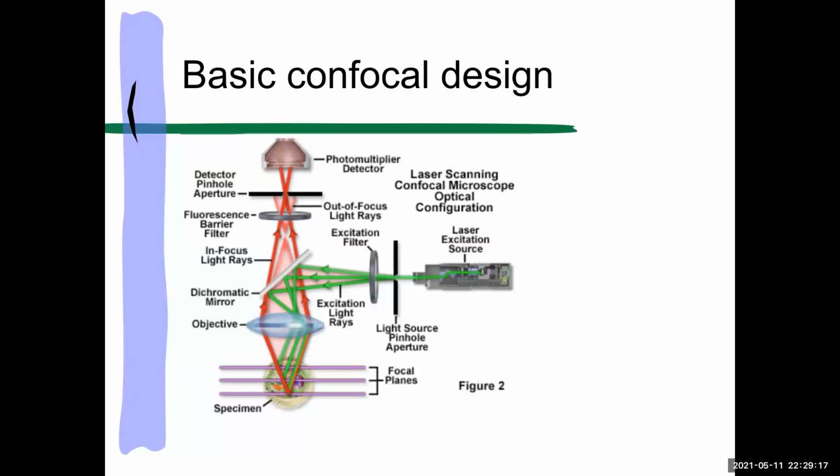The truth is, in a typical cell you can only take about 10 sections or so, depending on the axial resolution of your scope. A lot of people overdo what's called oversampling. They just take lots and lots because it feels better. So you can take more than 3 focal planes through one cell, but not all that much more.